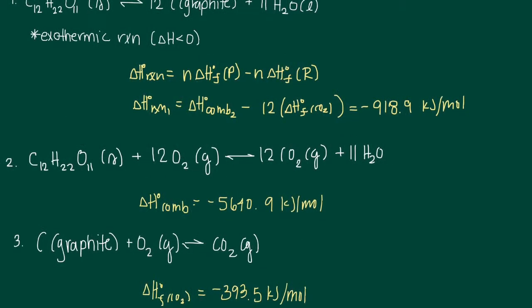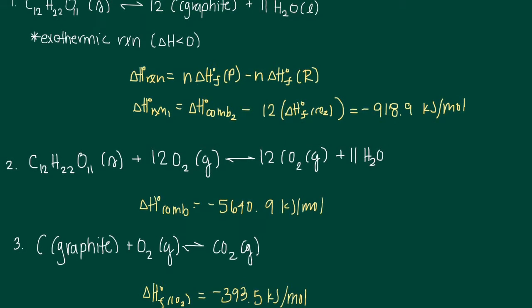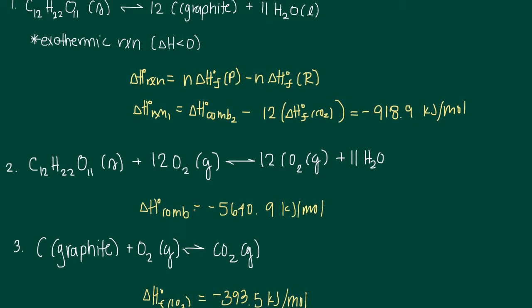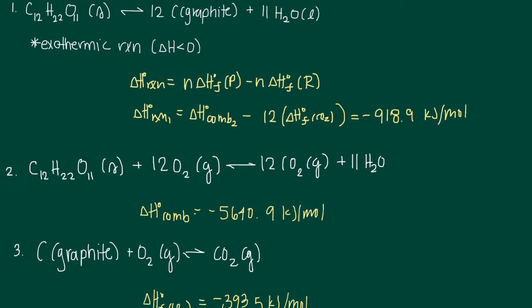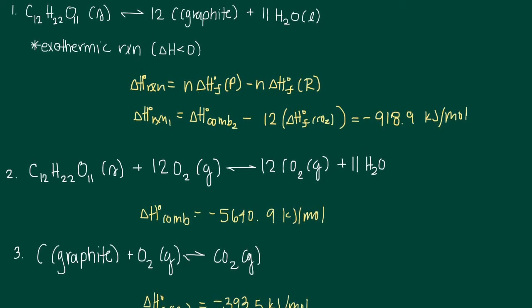There are 3 reactions occurring in this demonstration. Note that the sulfuric acid is not included, and this is because it is a catalyst, so it is not used up and reappears at the end of the overall reaction. The first reaction is the dehydration of sugar. This is an exothermic reaction, which means that it produces heat.